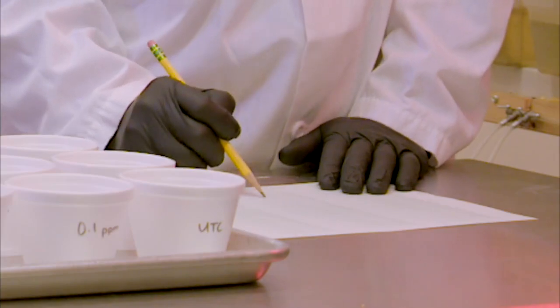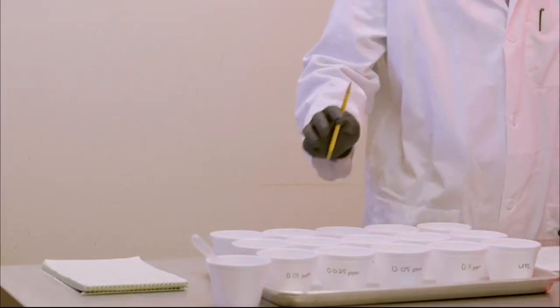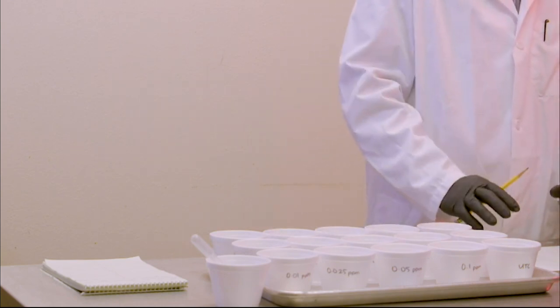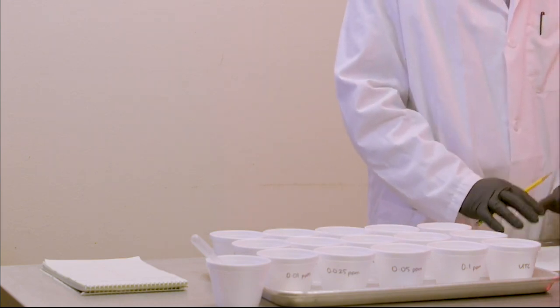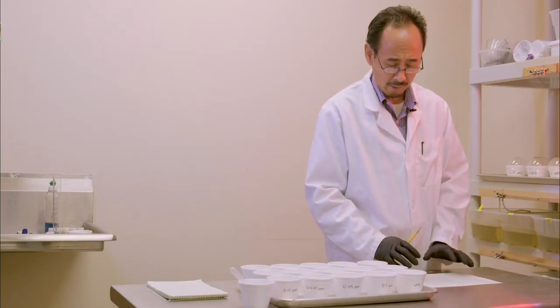If you see a nice distribution of the points like this, from your low to high concentration, approximating a straight line, that means good data quality. You will then continue with your data analysis using a computer.